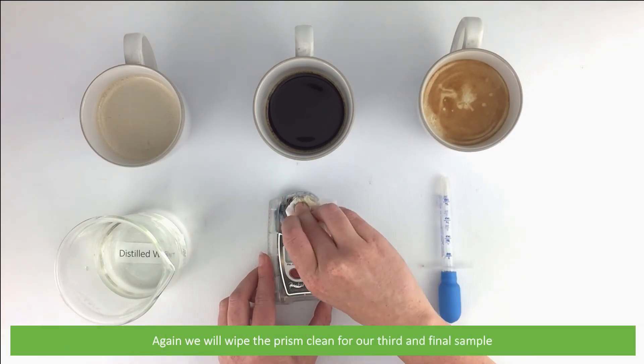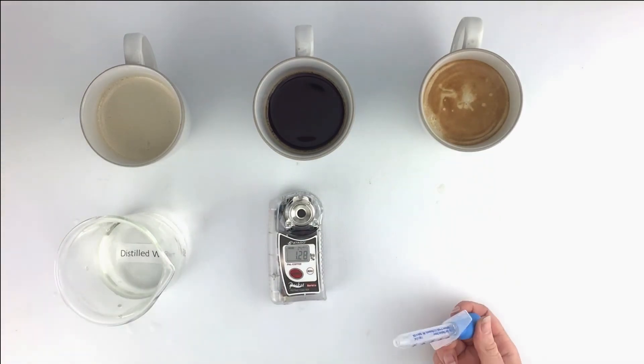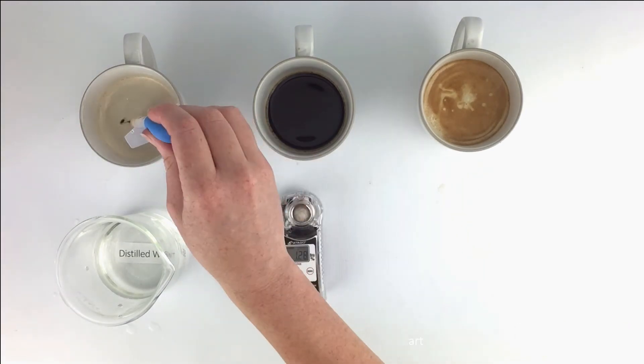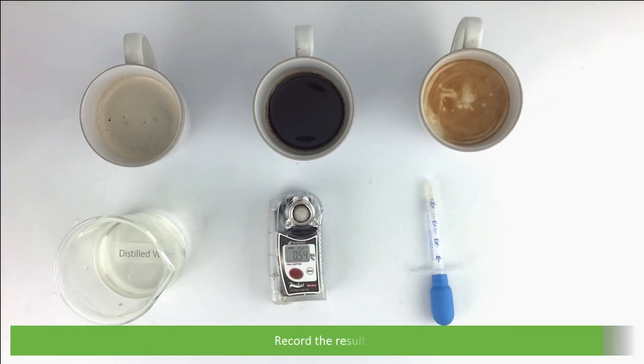We'll wipe the prism clean for our third and final sample. Apply 0.3 mls of the sample then press start. Stop the continuous measurement by pressing start again, then record the results.